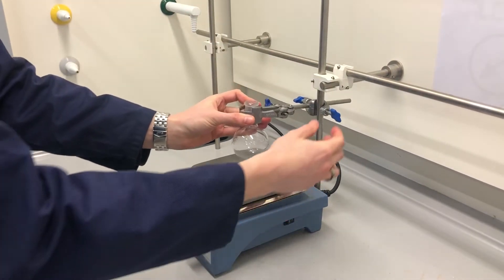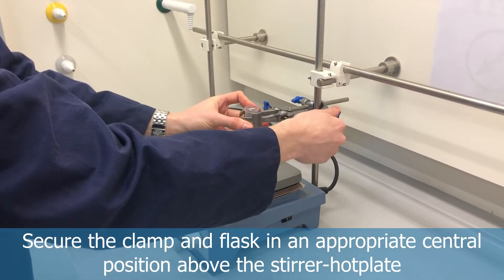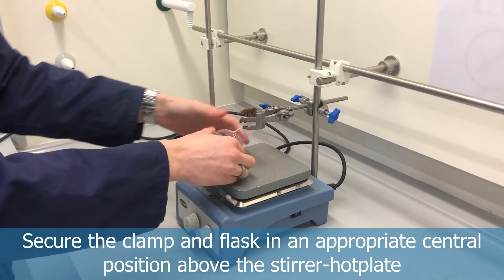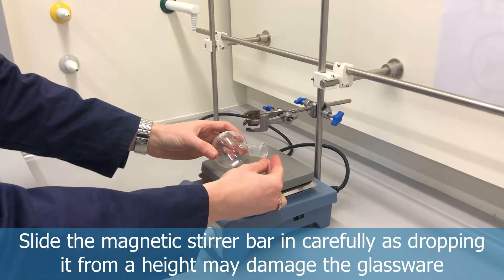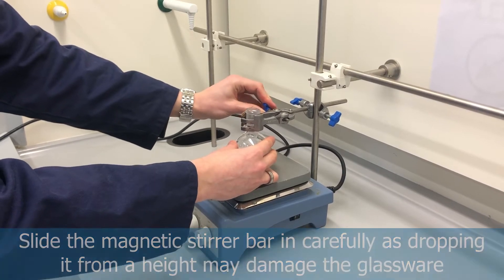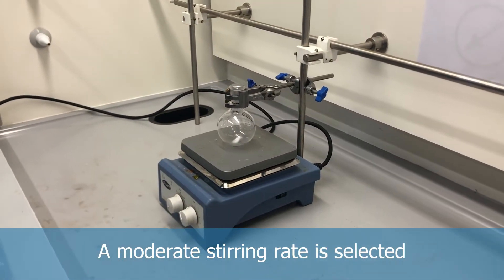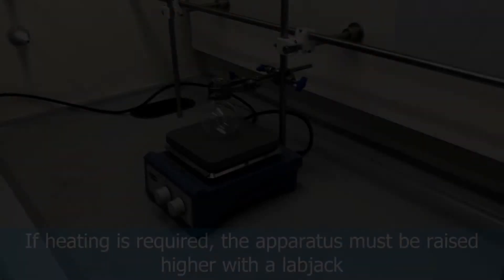Once in position, lower the clamping arrangement to sit in a nice central position so that you get efficient stirring. If it's off-center, the stirrer bar goes a bit erratic and is disrupted. Make sure you slide the stirrer bar into the glassware instead of dropping it from a height, as that can cause damage. Select a moderate stirring rate so you don't disrupt the reaction mixture too much.